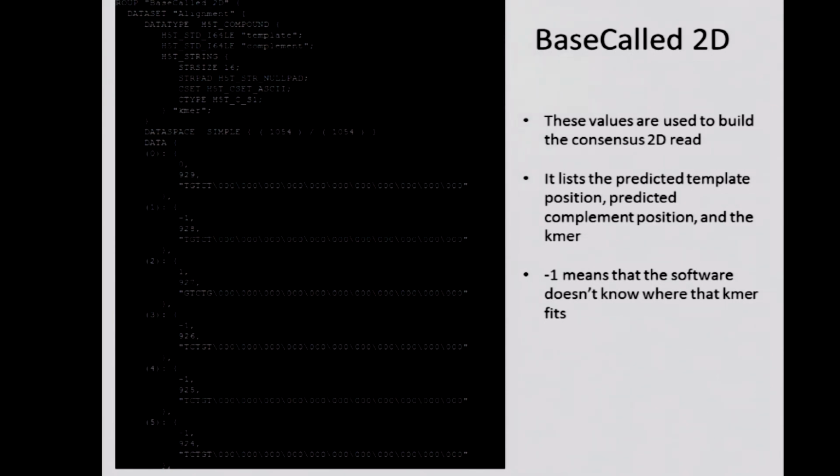It's confused. So when you see this -1 shifts in the position in one of the strands, that means, okay, we don't think this fits right, let's not use this. And they will try to account for those values when they produce the consensus sequence. Yay, something actually useful comes out for those people who are not algorithm people.